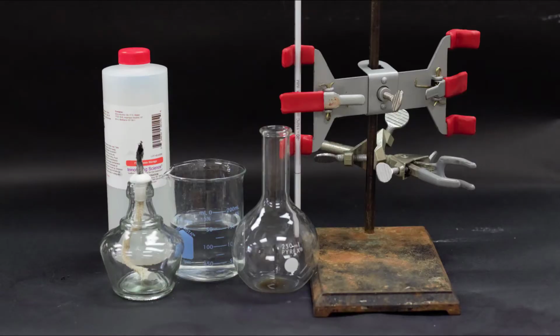The materials that you'll need for this lab are an alcohol burner, a ring stand, a thermometer, a 250 milliliter Florence flask, 150 milliliters of water, a clamp for the thermometer, a clamp for the flask, and some ethanol. The water that you use in this lab does not need to be distilled water.